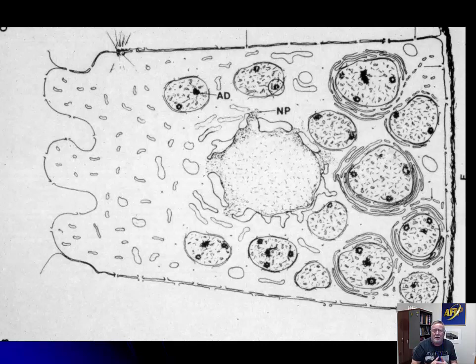They're very stereotypical. So I'm very confident that even with this brief instruction, you will be able to recognize degenerative cells. And as we go through these lectures, we're going to look at a lot of cells. We're going to be able to identify what cell type they are, and whether they are degenerate or not, before we start adding in the other fun things like viruses and bacteria. And hopefully I will remember to point out what makes a cell a particular cell. Where is it degenerative? How do I know it's degenerative? And so on further down the road.